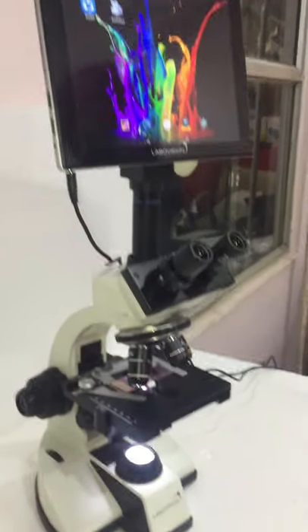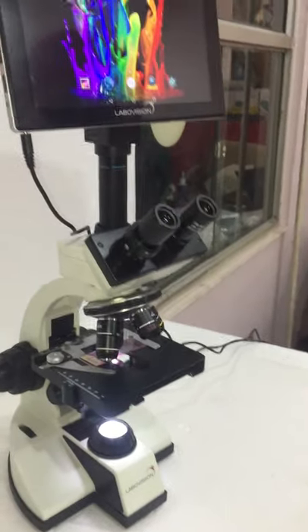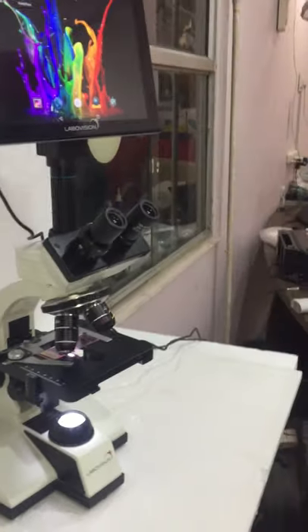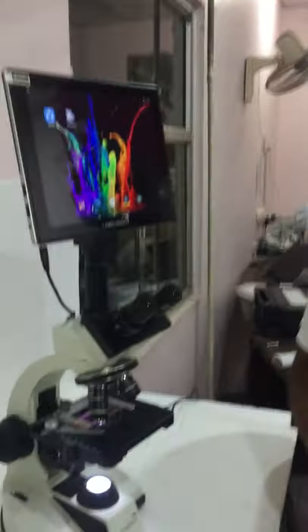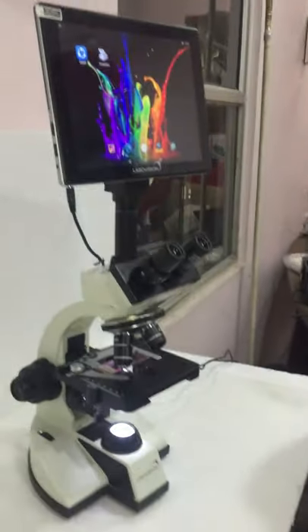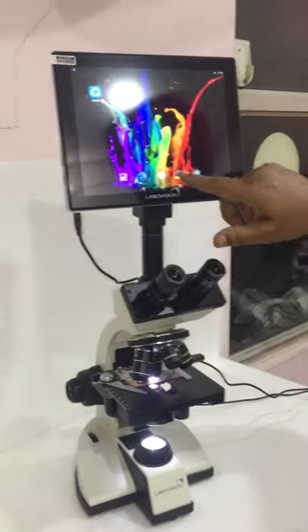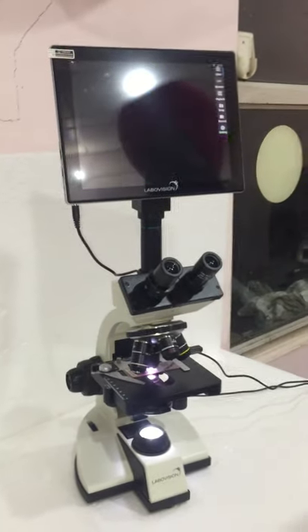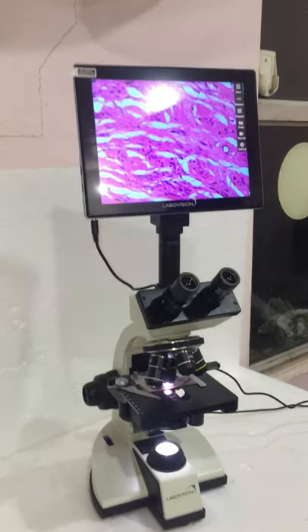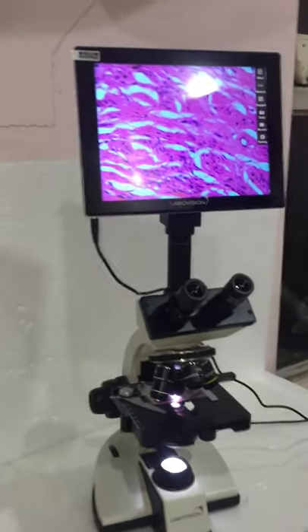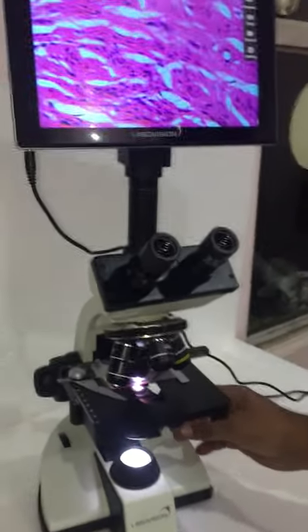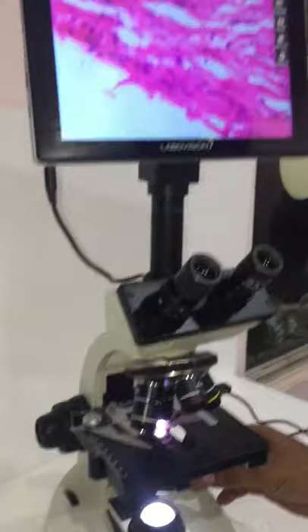Our engineer Mr. Gutendr Duna is here and will demonstrate how the screen works on the slide. This is the live feed being shown on the slide — he is actually moving the slide and controlling the scene.